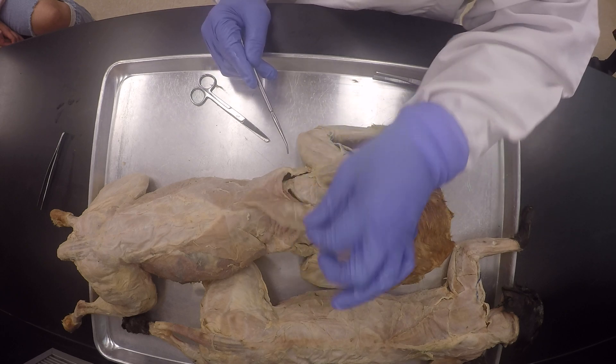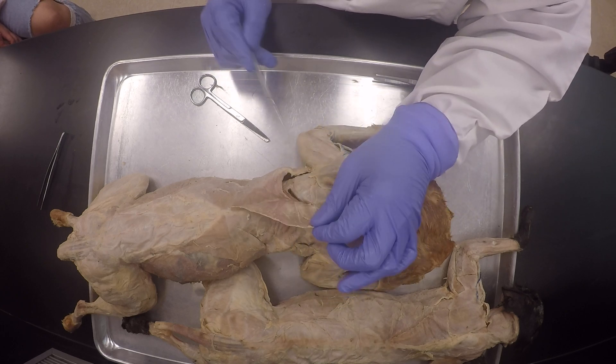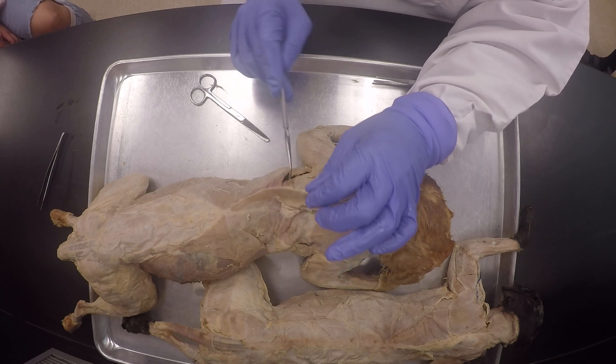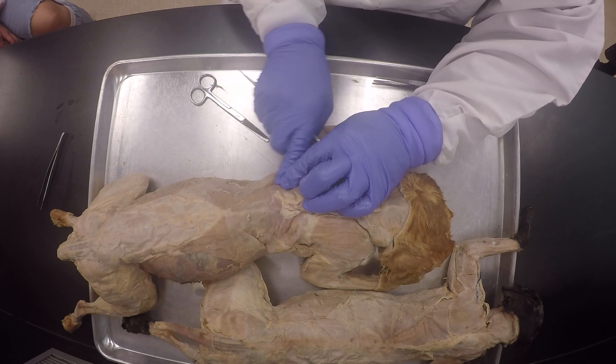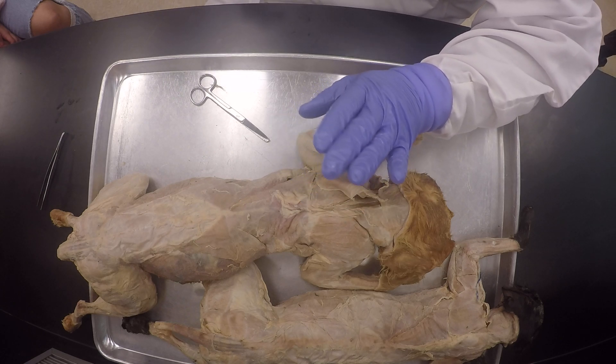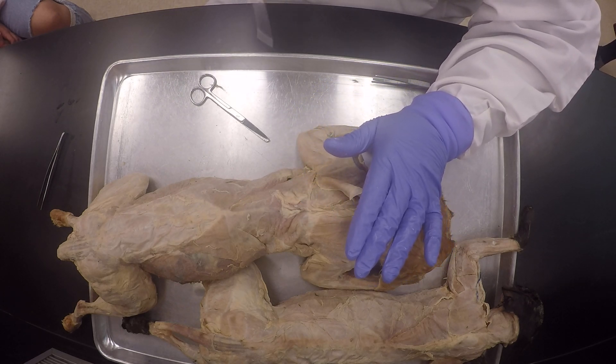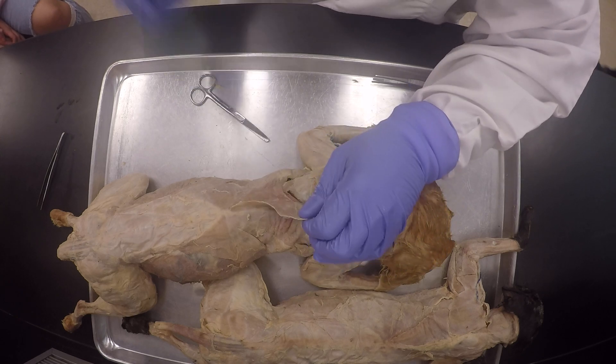Make sure you separate the spinal trapezius from the latissimus dorsi before you cut — don't be cutting through both of them at the same time. Don't do that. I've seen that happen, and even after saying this profusely — you see what I'm saying? So don't do that, my good friends.